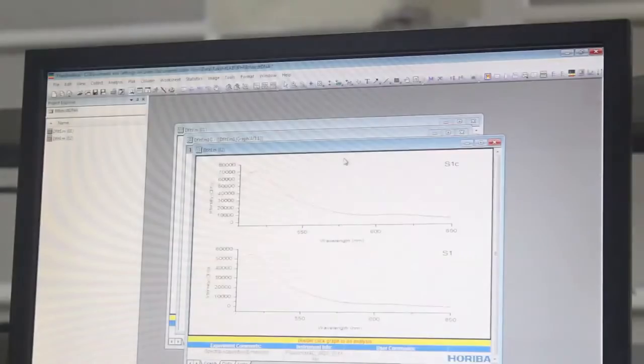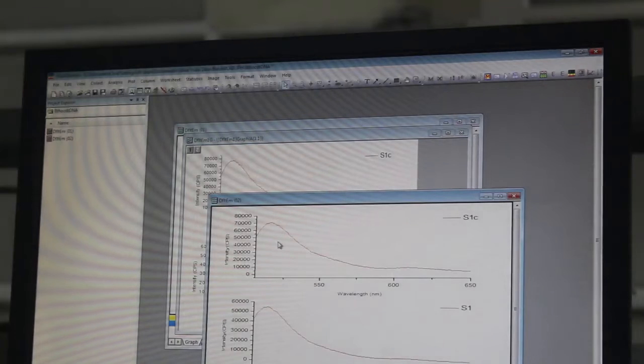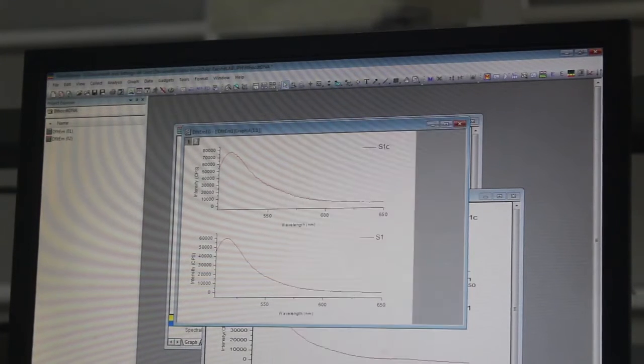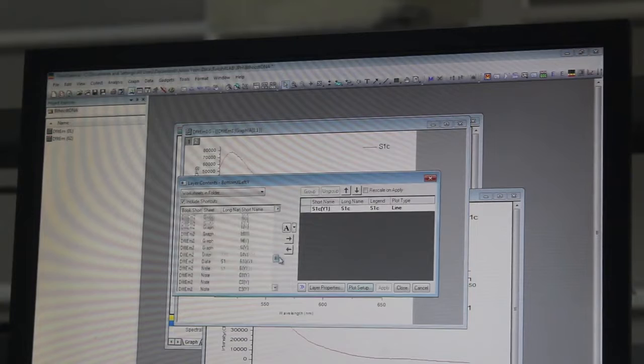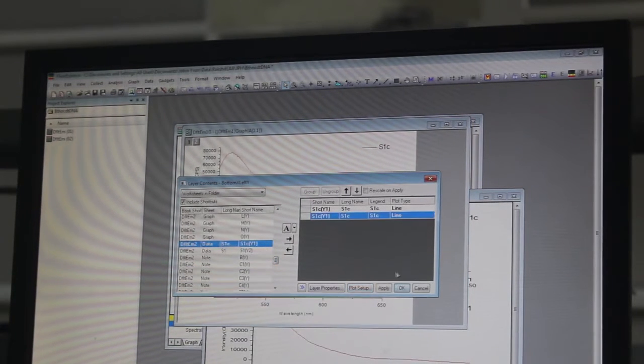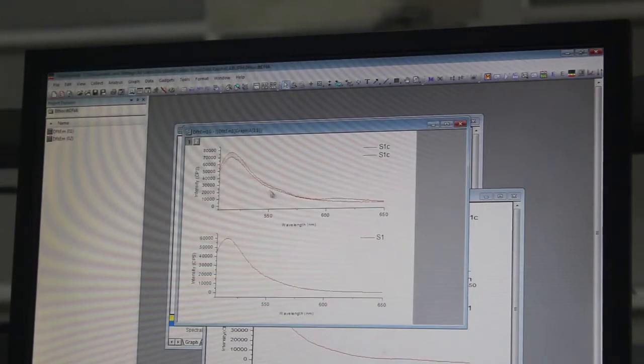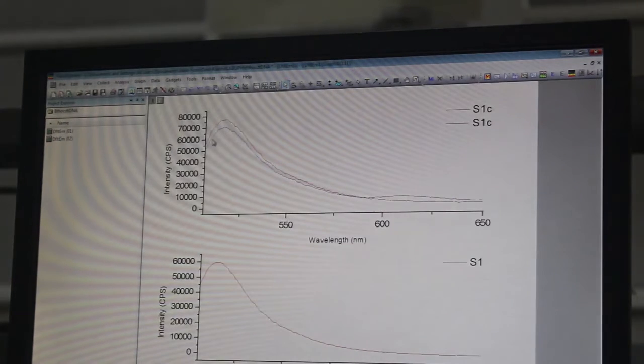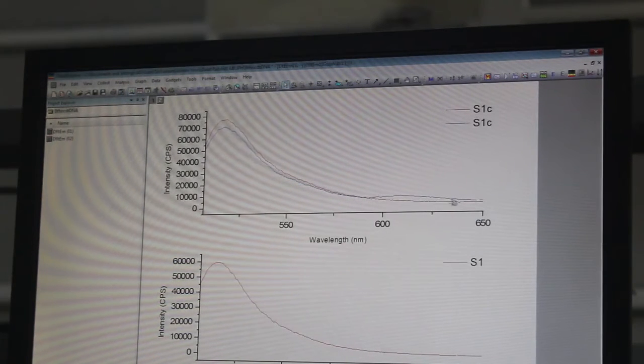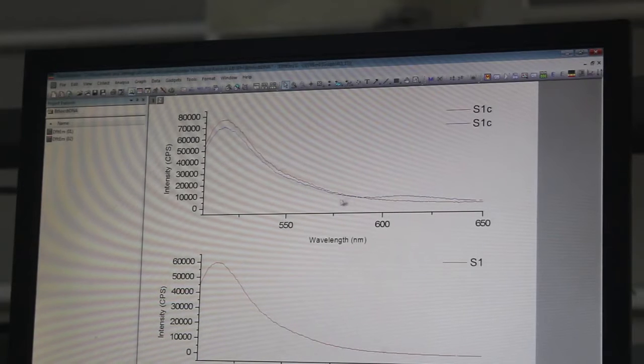We click on run. We overlay this spectra with our previously collected spectra. We go to layer contents and take the S1 corrected towards this side and overlay both of them. If you see, the donor intensity has decreased and acceptor intensity has appeared. That means both the DNA has hybridized and FRET is happening.